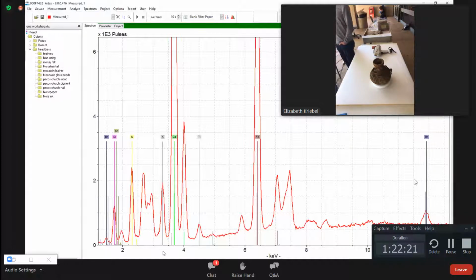Yes, and this bromine peak is bigger than we've seen in the past. And bromine is not something that's just hanging around all over the place. So this is a treatment with the pesticide? I think so. I think this is methyl bromide. That would be the most parsimonious way for me to explain the presence of bromine in the spectrum, but divorced from chlorine.